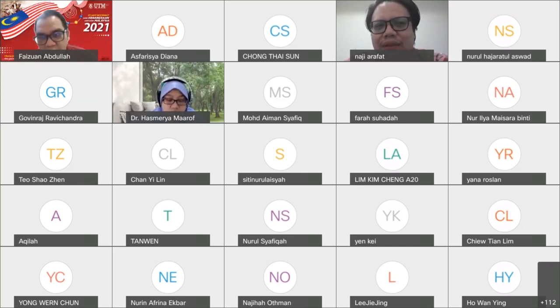Tapi I haven't given you the answer why nitric acid, not sulfuric acid, right? So I want you to find out why. Okay, who can answer that? Why nitric acid instead of sulfuric acid? Dua-dua tu acid kuat. Kenapa kena guna nitric acid? Tak apalah, tulis dalam report nanti. Kita tengok jawapan dia.